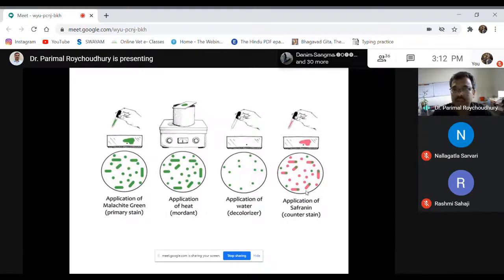That produces a central spore, present at the center of the bacteria, and it is almond shaped or oval. These criteria are helpful in identification of bacteria. To see whether it is central, subterminal or terminal, bulging or non-bulging, oval or round, to study these characteristics of the organism, we go for spore staining.